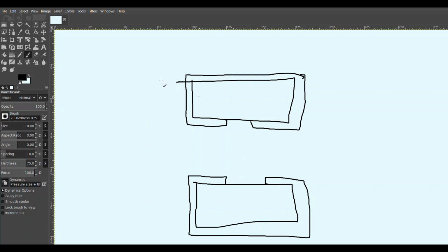So here is a magnet, an electromagnet really, and it's surrounded by iron. This is really to strengthen the magnets, which are already way strong.